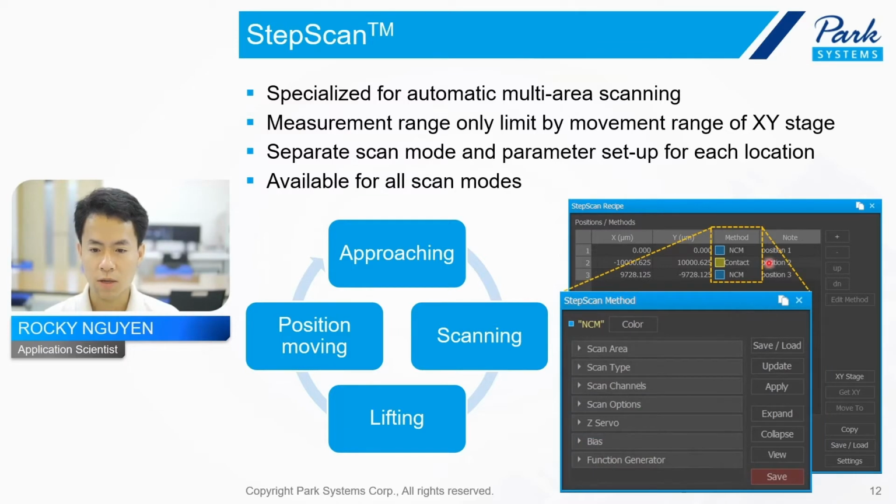And also you can input different scan modes, different methods like NCM, contact, or even KPFM, EFM in different locations. So the only limitation here is the movement range of the XY stage of the system.